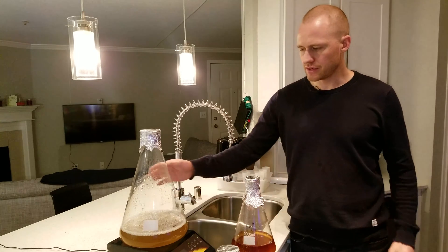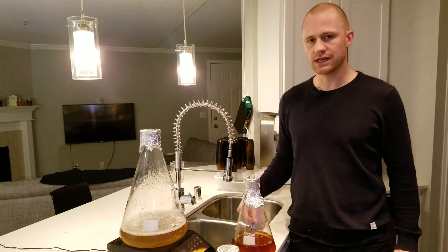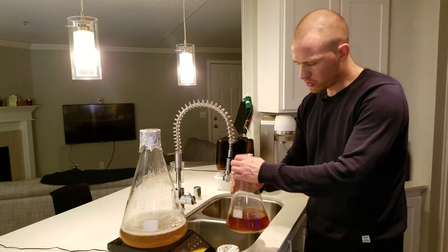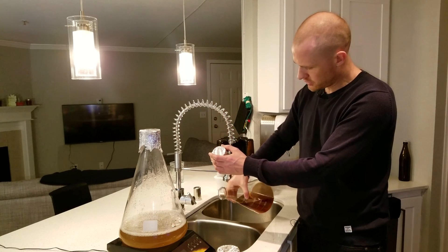What I have here is a regular yeast starter. Go back to the previous video on how to make a yeast starter if you have not done so. I'm going to go ahead and pour off some of the excess liquid, leaving some behind because I need to be able to stir it into solution.